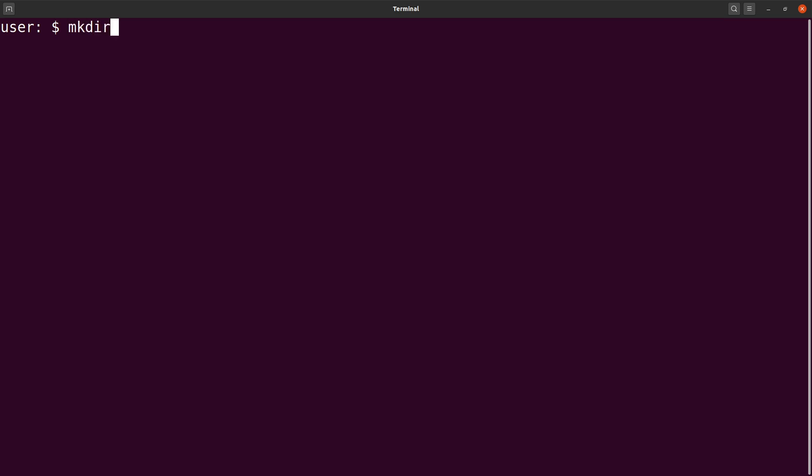I'll say mkdir vcfs, then I will cd to it. The reason why I do this is to separate files that I'll be generating for this exercise from other files on my PC. Doing this helps you to organize your files and prevent accidental removal of files and modification of files. That is why I create directories for every project that I do.